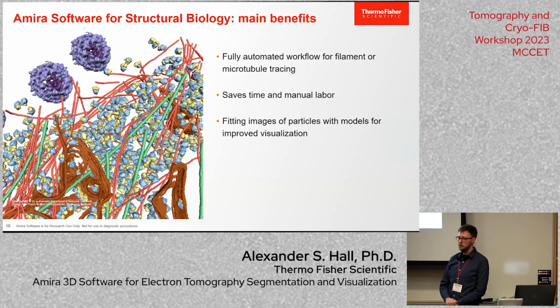And one thing you could do is, for any individual object you see segmented here, I could pull out a point that represents its center of gravity, and you could export that as a point cloud, which is very, very versatile. You could also do that on membranes or tube-like structures. So you could have a sheet of points. Is that what you're thinking about?